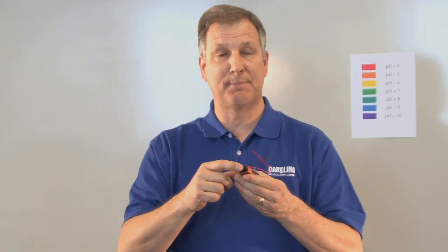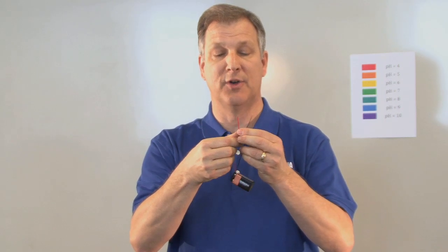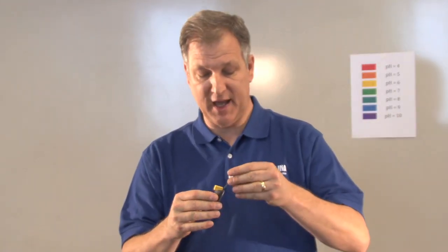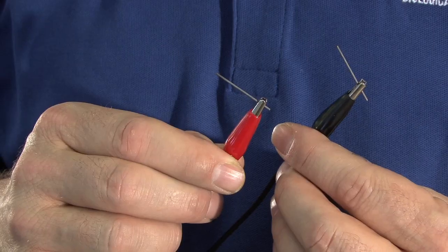To actually provide the energy for electrolysis, we're going to use a simple 9-volt battery. You can either use the little caps that have a red and black type of wire, or we can use simple alligator clips. We can use a piece of pencil lead and use that as the electrode also.